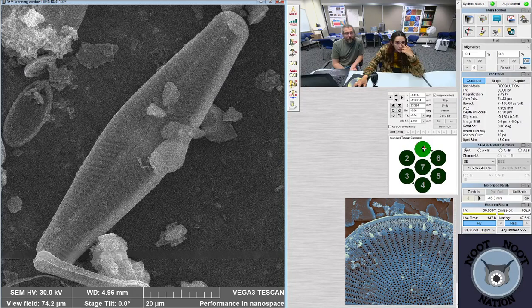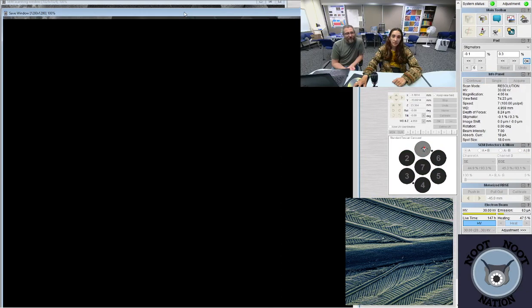This one's Navicula, but not oblonga. Correct. Okay, we're getting there.